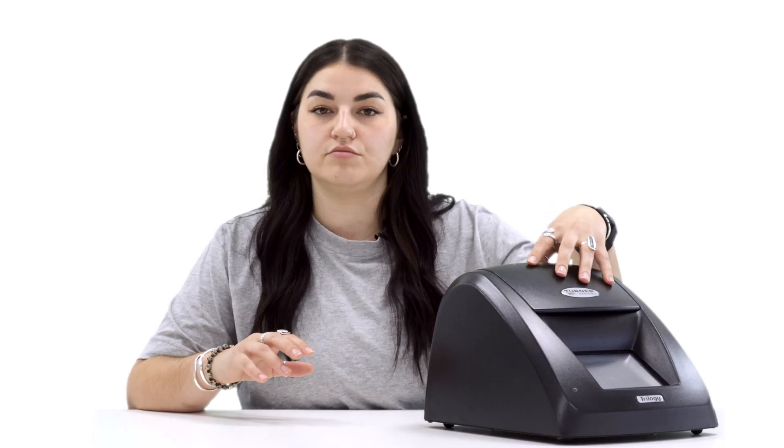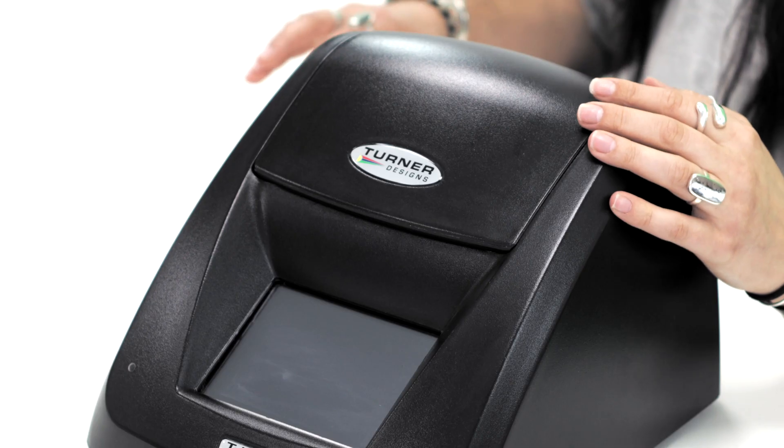The Trilogy has a snap-in chamber which can take all of the optical modules. It can also store up to 18 user-defined calibrations for each of these modules, with up to five calibration standards.